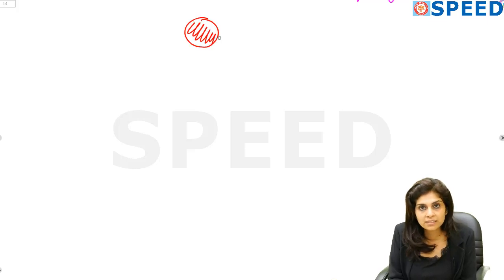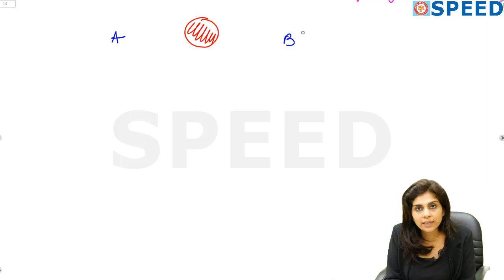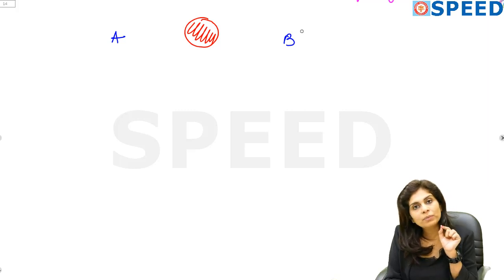Okay, they have obtained a blood stain. And there are two suspects, person A and person B. You are asked to find out who could have committed the crime. Okay, what would be the first step?